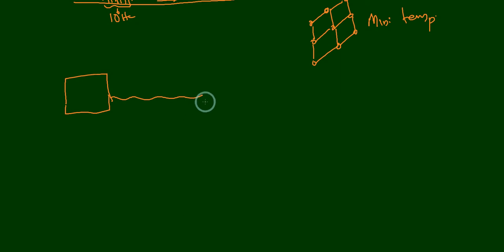Then he used metallic iron, and he placed a Geiger counter behind that. Then he saw that there is a fall in the Geiger counter reading. And why is there a fall in the Geiger counter reading? Because the metallic iron absorbed the gamma ray which was coming from this solid cobalt 57 lattice.